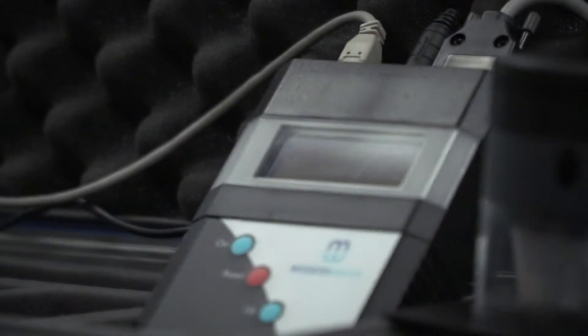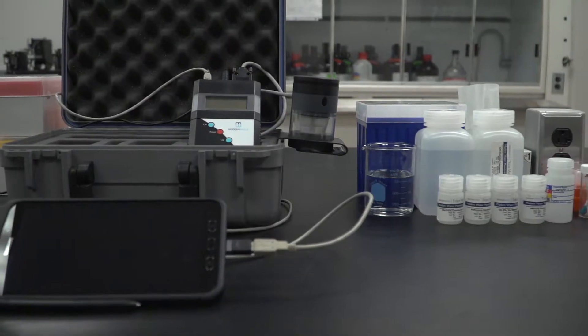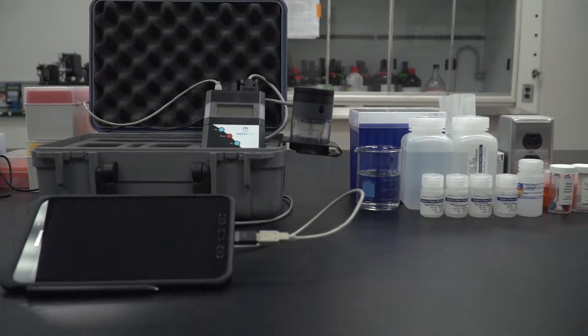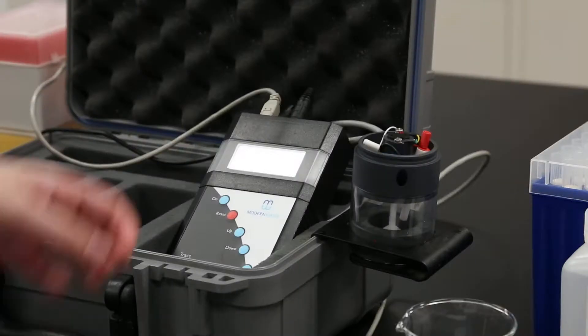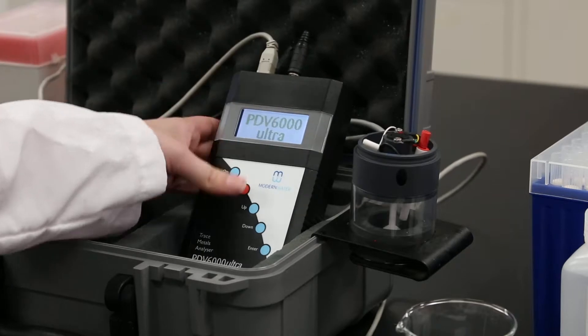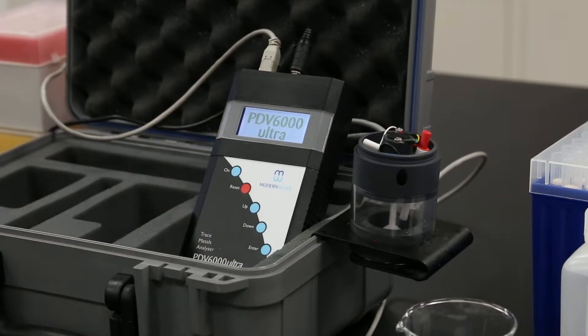The Microtrace PDV can be used with a tablet for on-site analysis or with a desktop computer for laboratory analysis. To begin using the device with the tablet software, turn on the PDV handset by pressing the on button.